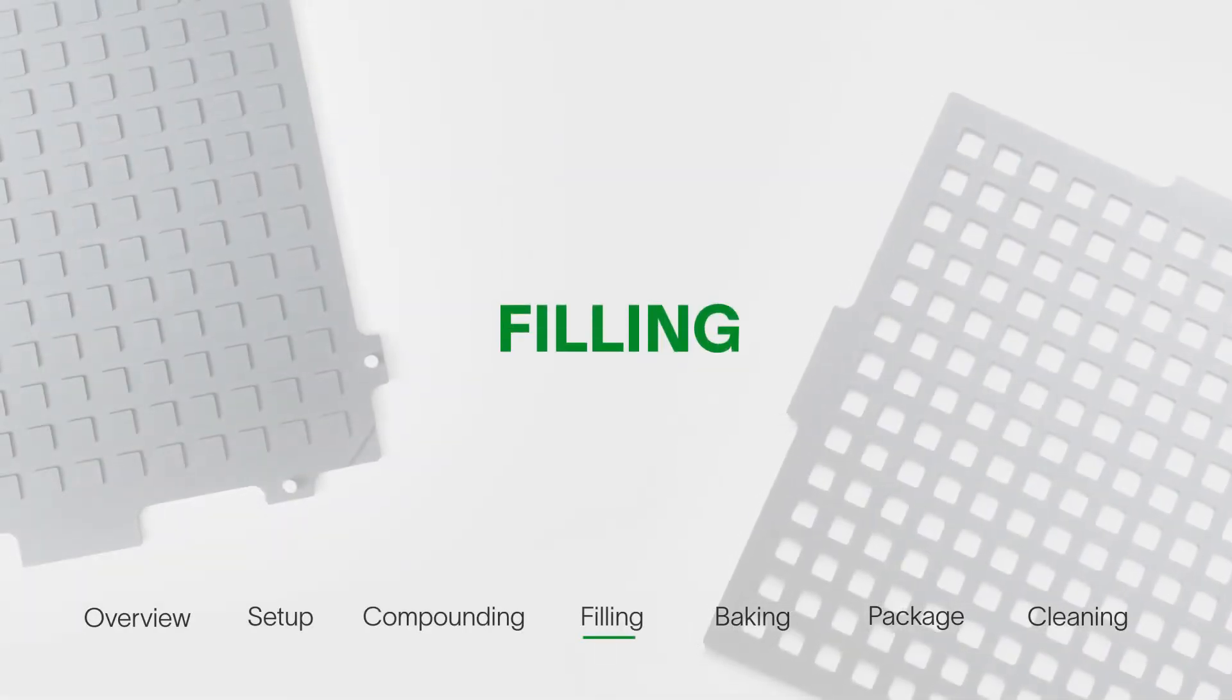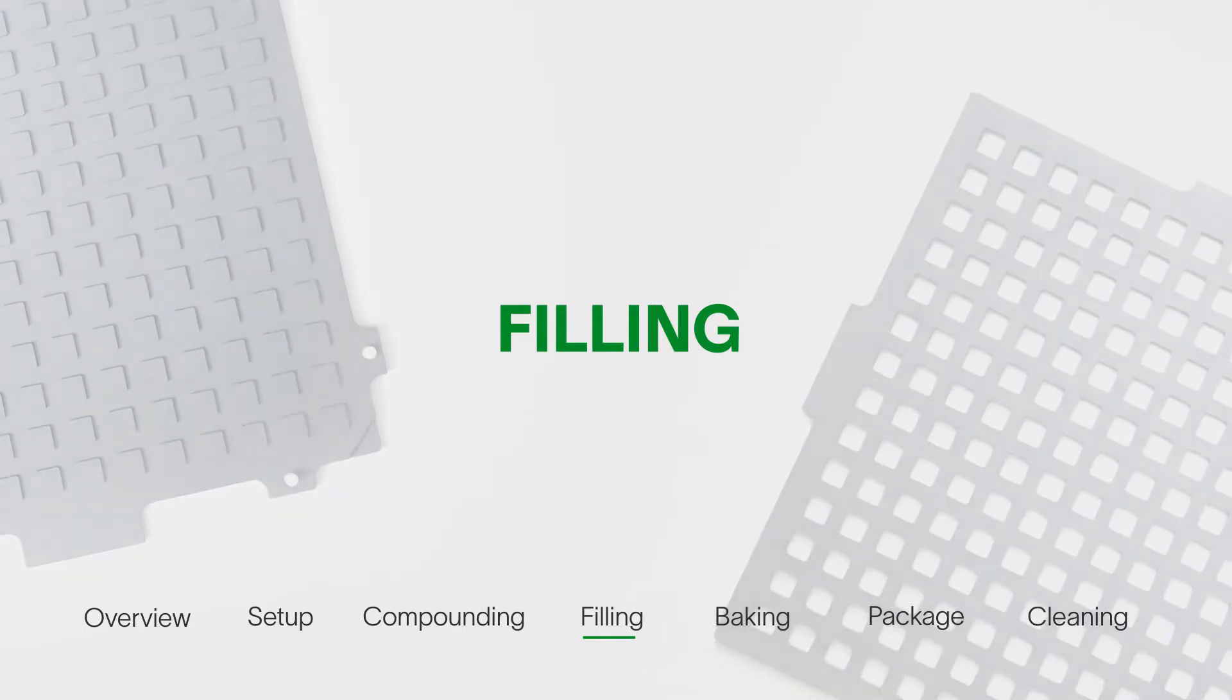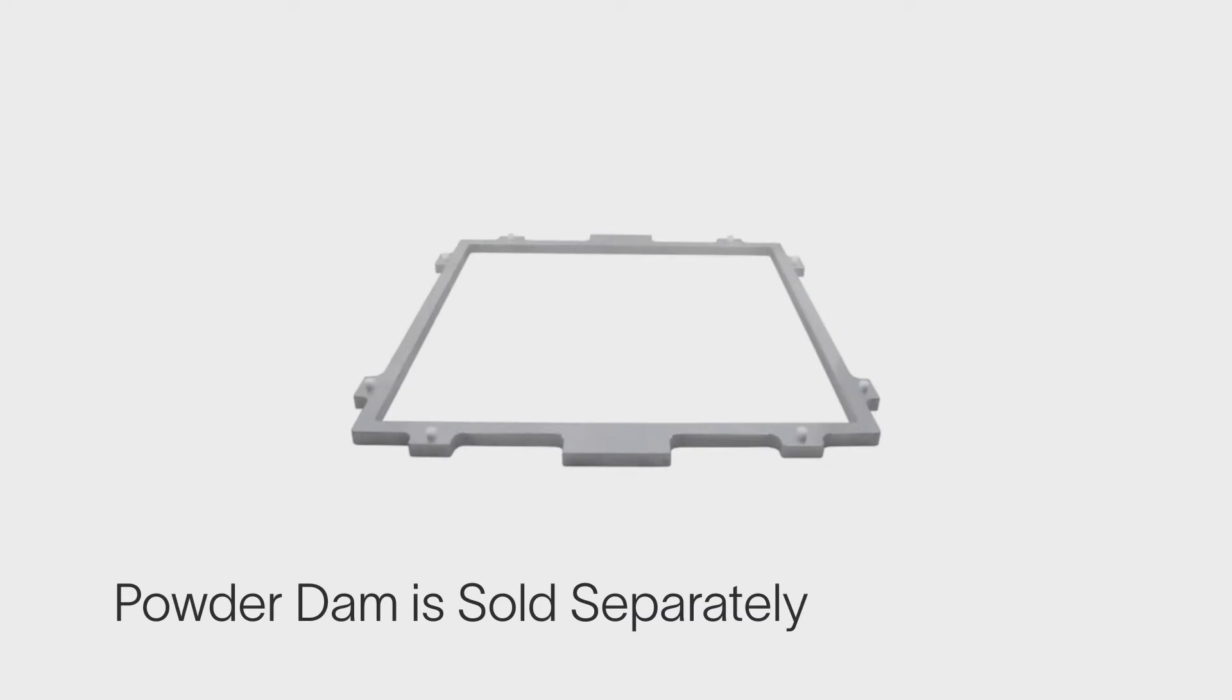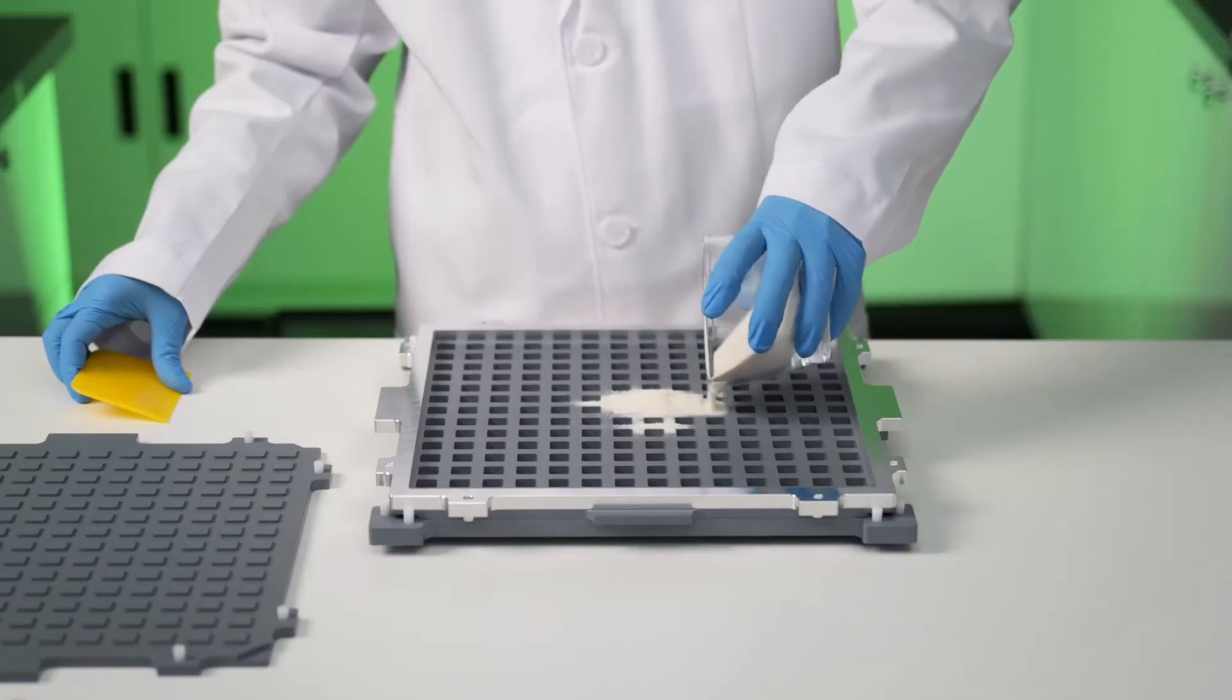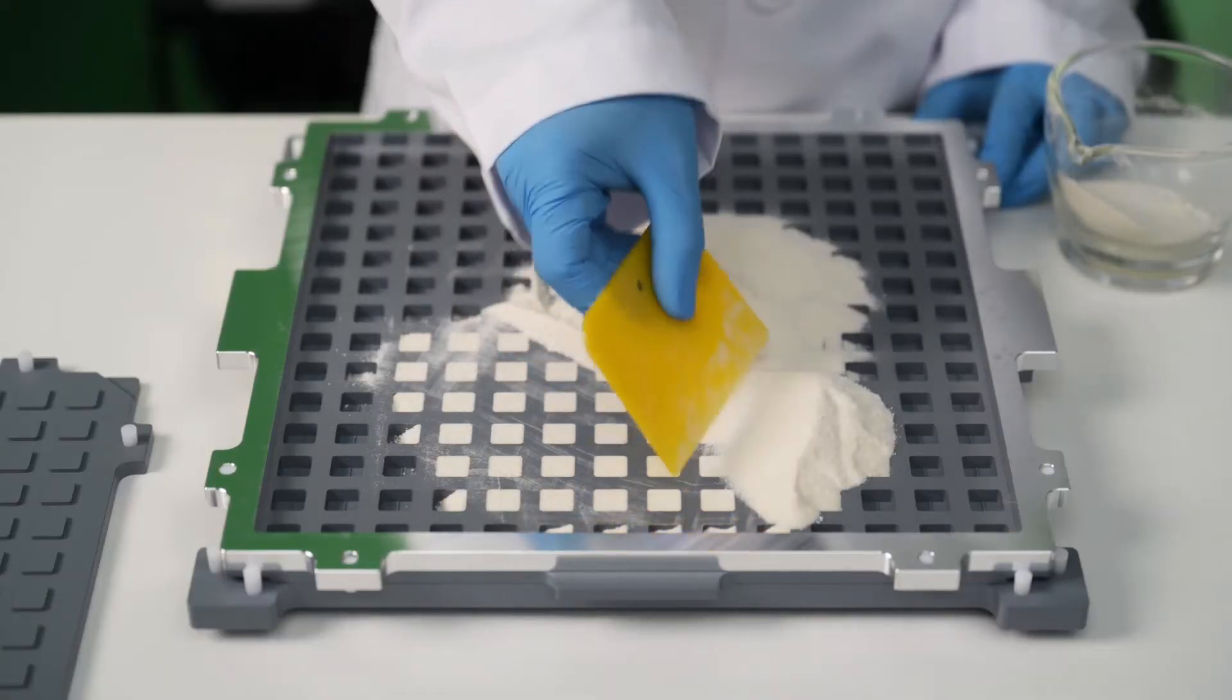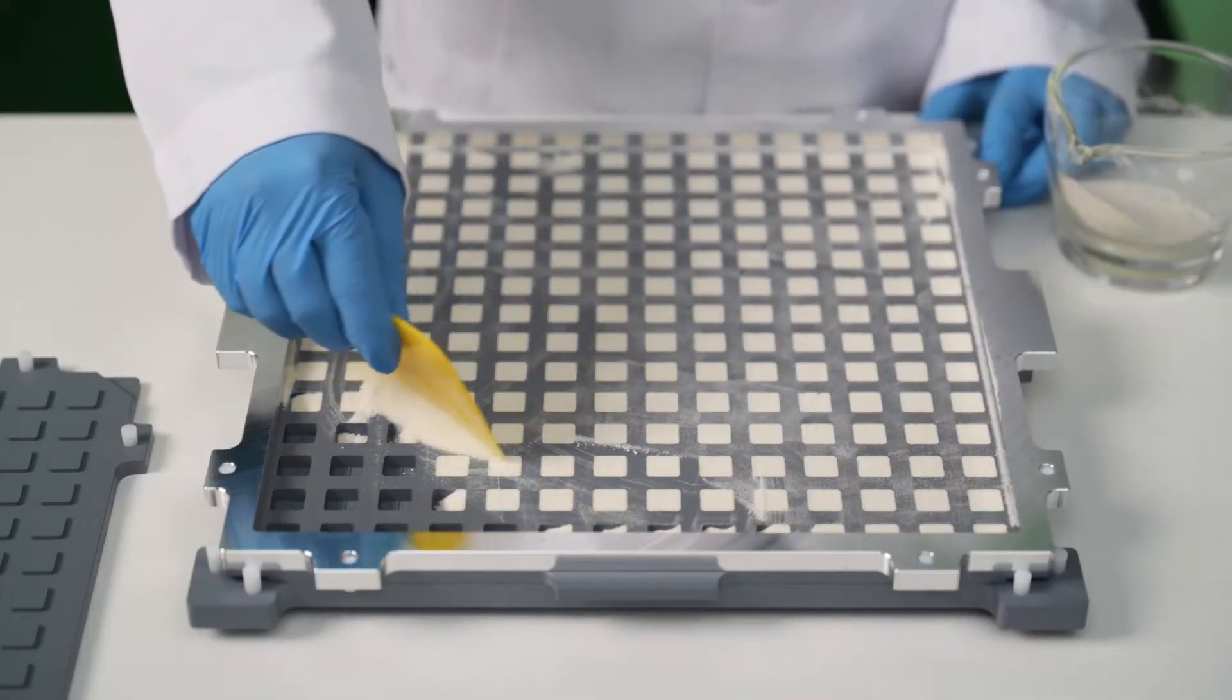Now it's time to fill the cavity mold once a homogeneous blend is achieved. Please note the powder dam is sold separately. Carefully pour the powdered blend into the cavity plate and use the scraper to spread the powder evenly around, filling the cavities as you go.